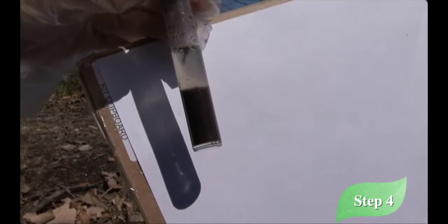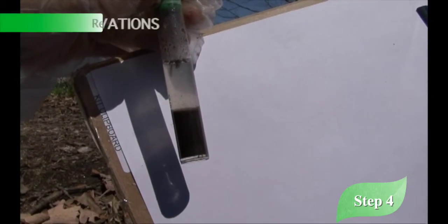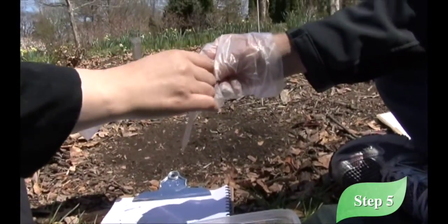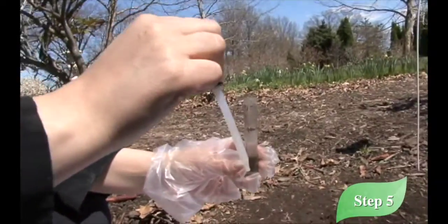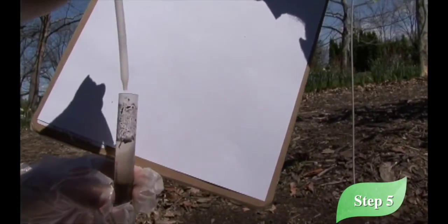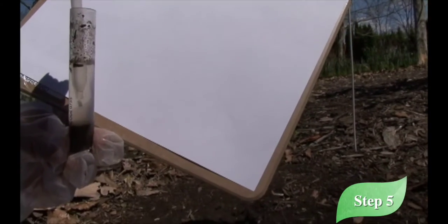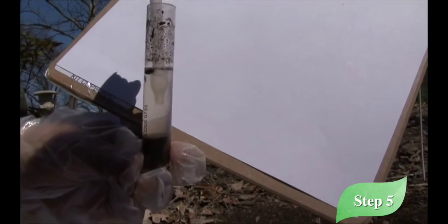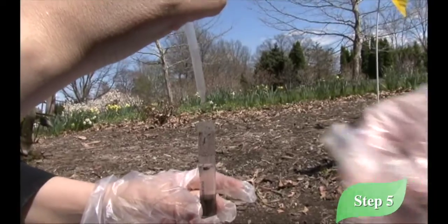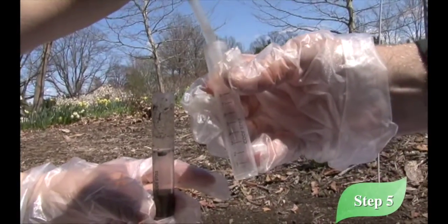In step 4, they tell us to let it rest, remove the cap, and allow the soil to settle until the liquid above the soil is clear. Let me write down some observations. Next, we're going to grab a pipette. This one happens to have a black lid. Some may say a red lid. You will have to squeeze the pipette, place it into the test tube, but do not get too close to the soil, and slowly pull the liquid from the solution. And then we're going to transfer it into the next test tube.